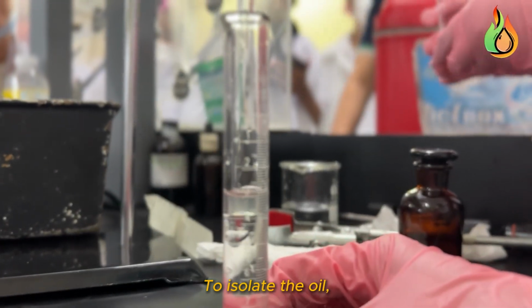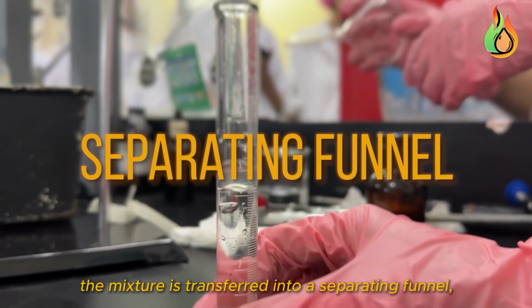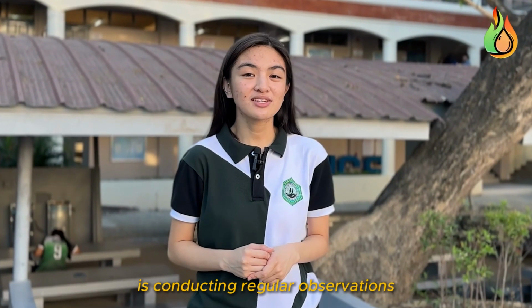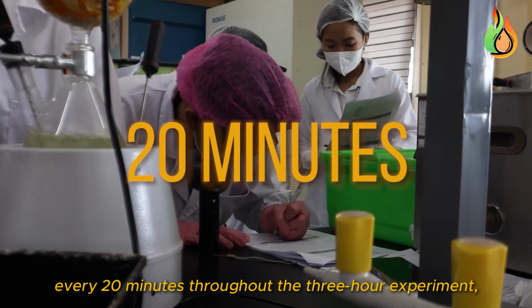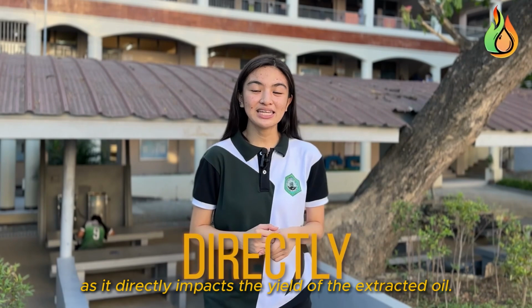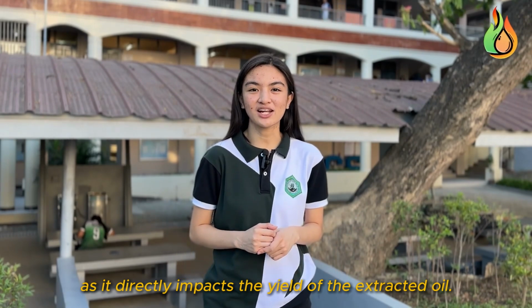To isolate the oil, the mixture is transferred into a separating funnel where the hydrosol is carefully removed. The most crucial step is conducting regular observations every 20 minutes throughout the 3-hour experiment, as it directly impacts the yield of the extracted oil.